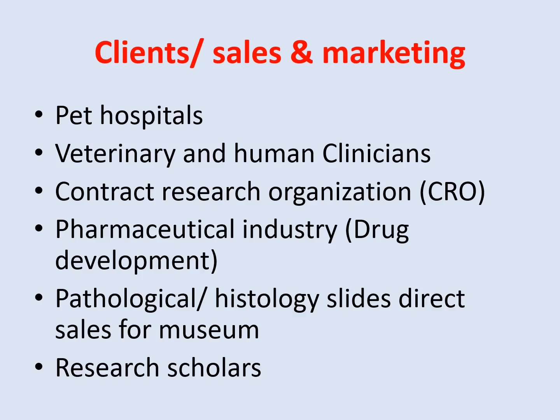The third one is, if you go for the manual option, there is very little requirement of money. So you need not spend much, but you can gain much. If you are going for automated tissue processing, then the cost is more, but if you are going for the manual method, the cost is very less. Most of the chemicals which are used in histopathology are very cheap. So this is a very cheap technique.